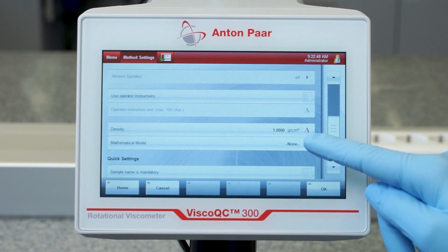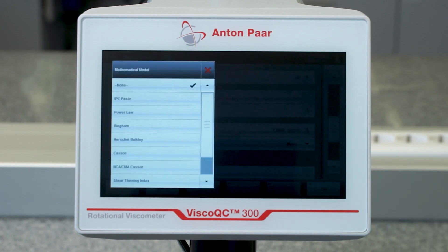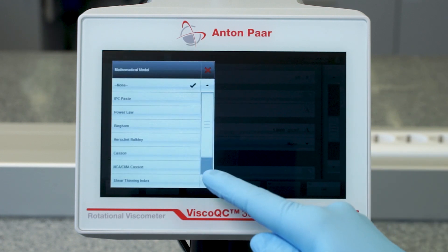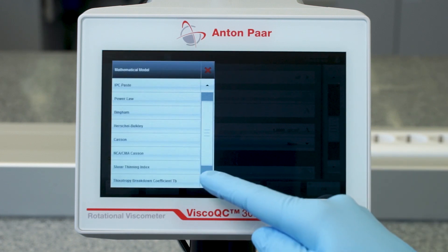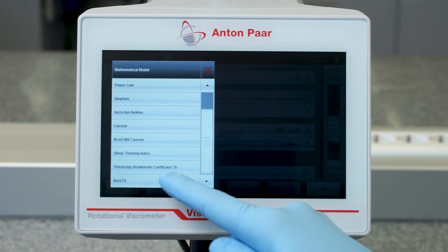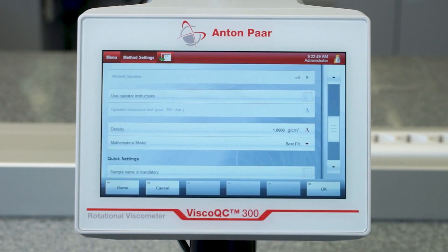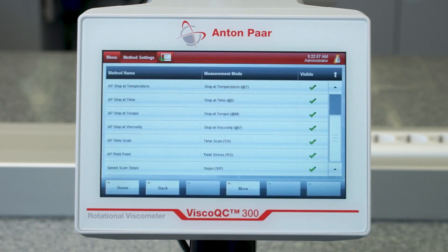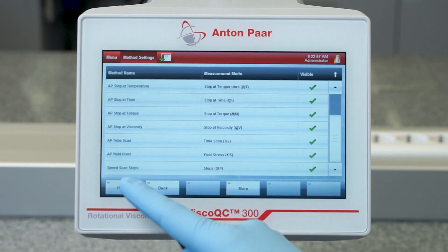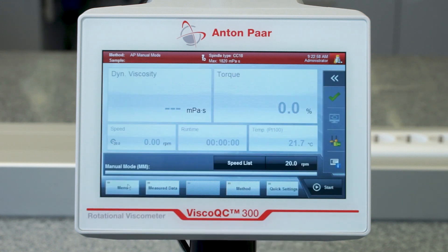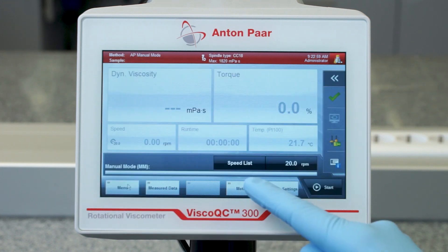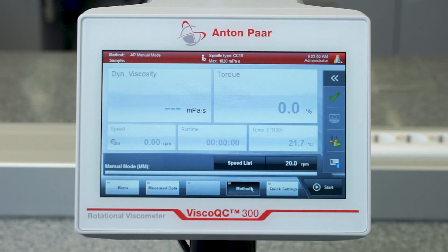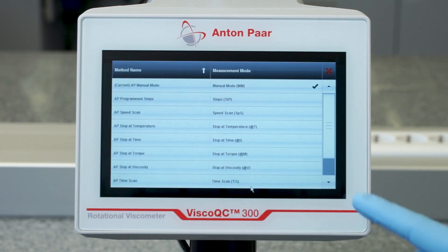Mathematical models are useful for measurement data analysis. If you do not know which analysis method you want, simply choose Best Fit. Tap OK when you are finished to save the method. Go back to the main screen and choose your method.